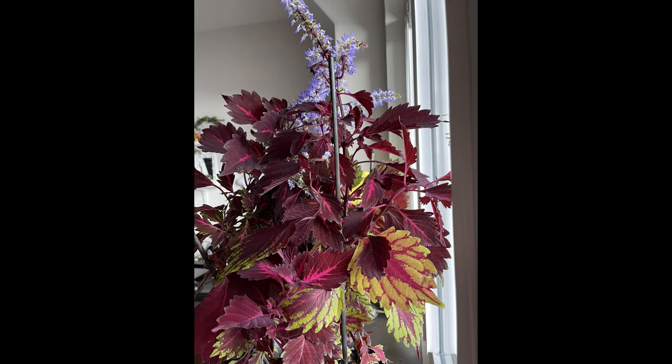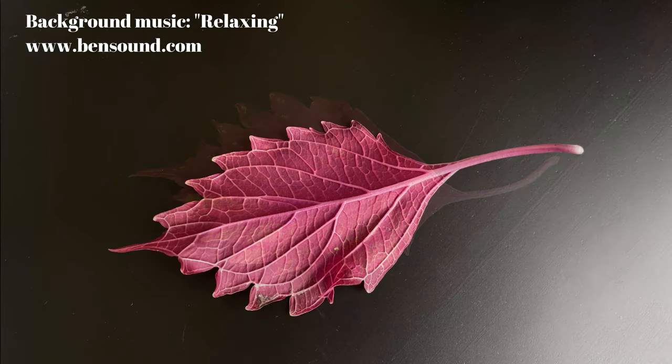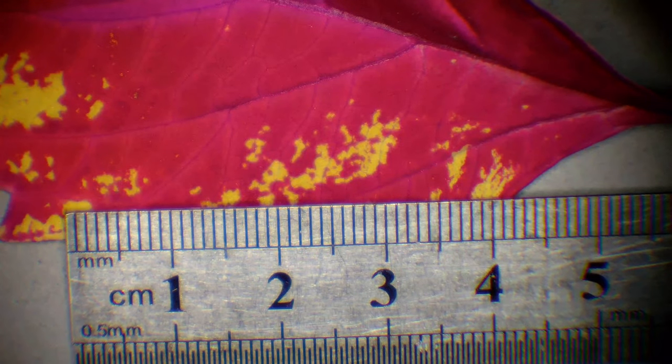Hello everyone! You're watching Let's Zoom It and the fifth episode of Under the Microscope, the mission. In this episode we're gonna take a look at the coleus leaf.